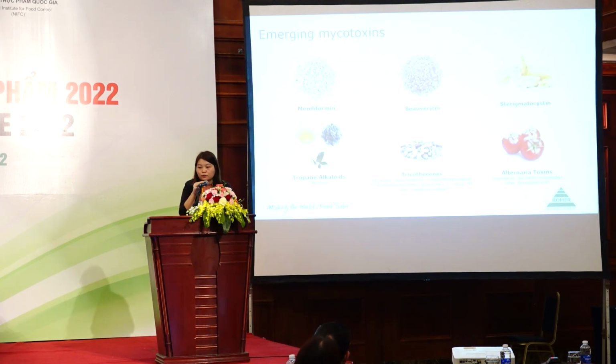So after this is actually the end of my ISO 17034 materials. I'll be talking a bit on the emerging mycotoxins. As we know, we have the common mycotoxins, the aflatoxins and ochratoxins, that we commonly test. They are routinely tested. But there are other types of mycotoxins that are seldom tested and not well studied.